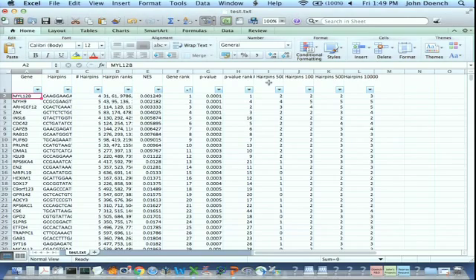How far down into your hit list should you go? Sometimes you can get that from the screen that you did. Again, in the case of strong positive selection, if very few things scored, then you shouldn't take 1,000 genes as your hit list. But for a lot of screens, it's not obvious: there's no bimodality between this is the signal, this is the noise, and I know exactly where to draw the cutoff. So practically what tends to happen is, well, what's your next assay, and how many things can you do in your next assay? It's a very practical but very useful way to say, okay, here's my hit list, or this is what I'm going to follow up on first.